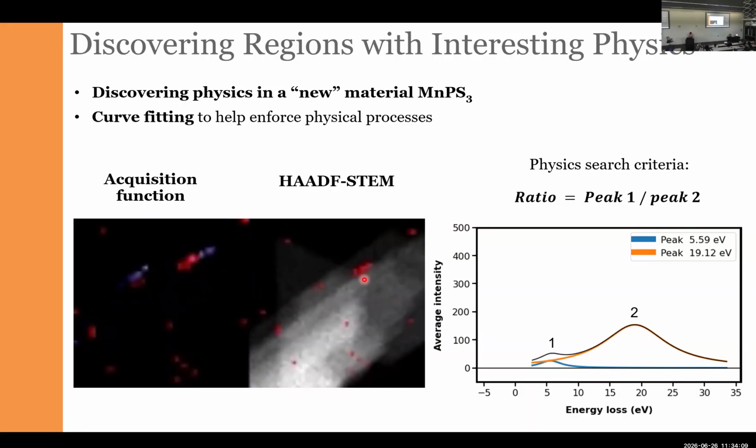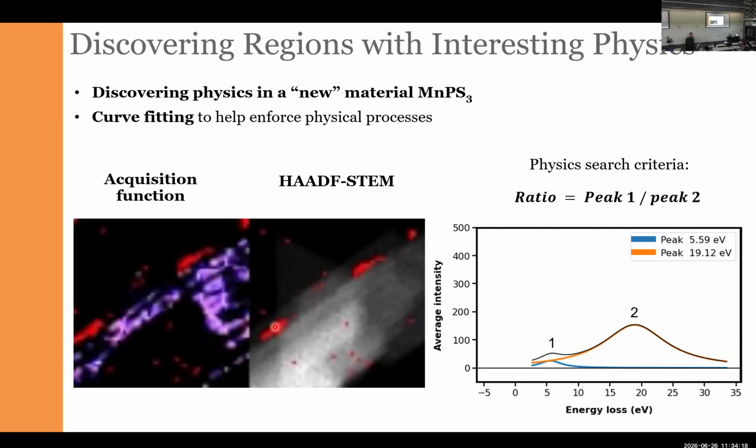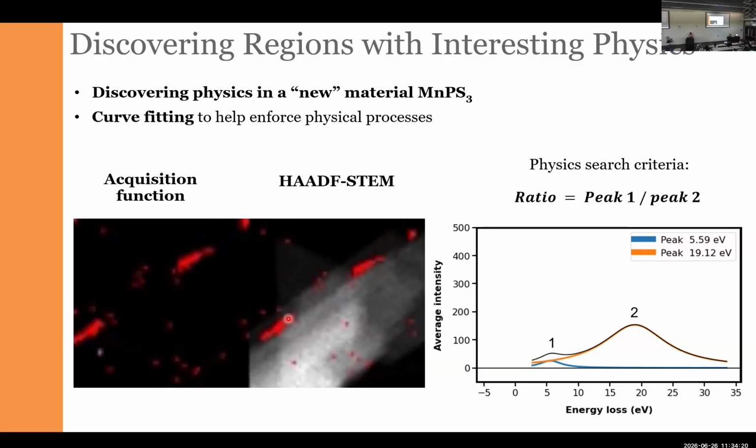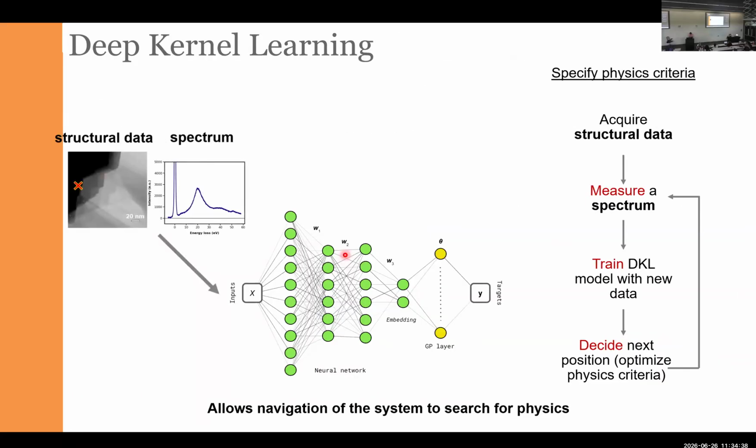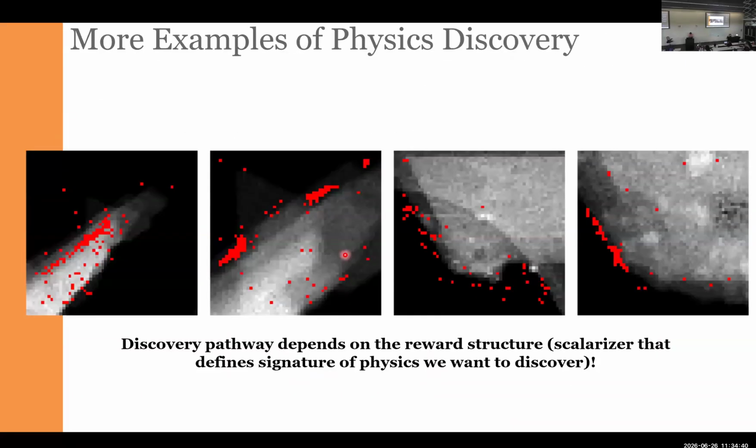This is probably the first truly automated experiment on the electron microscope anywhere in the world. This is the flake. The red dots are the locations where the instrument takes measurements. And this is the evolution of our acquisition function. You see that our experiment nicely focused on these regions, but it ignores the rest of the material, and especially it ignores the hole. So this is our schematic.